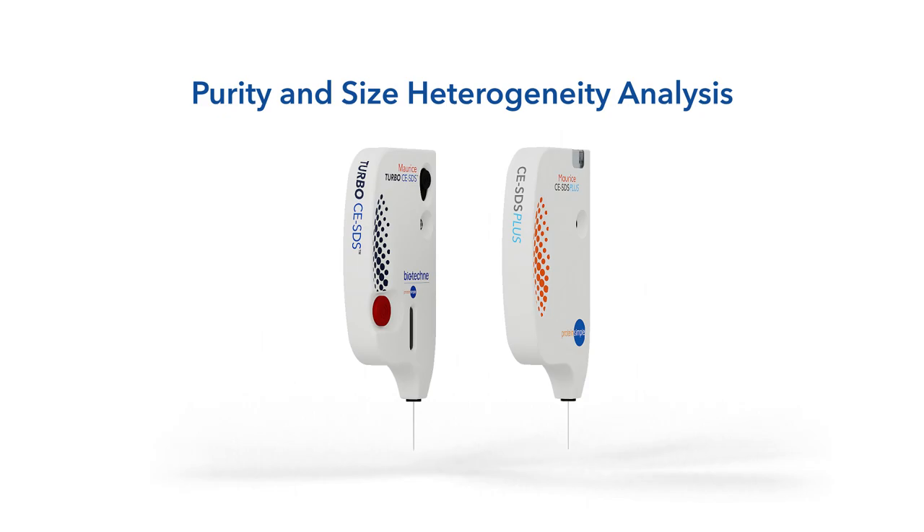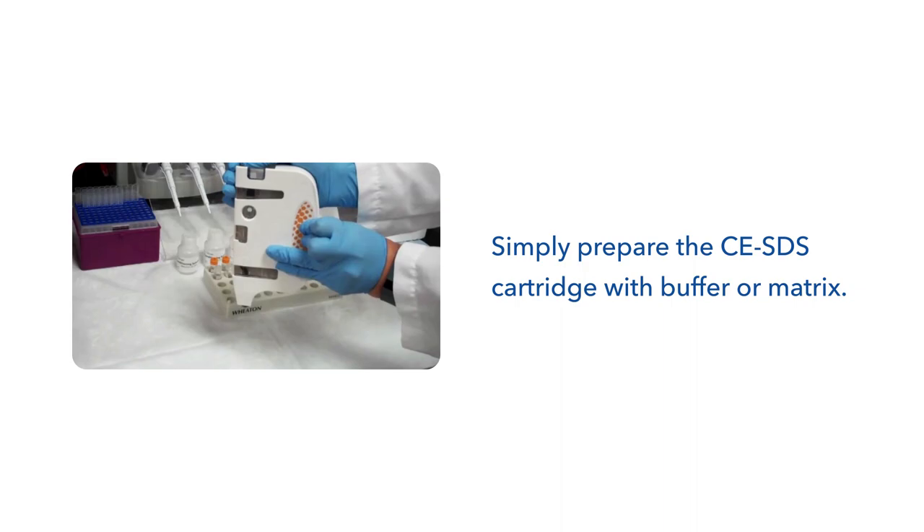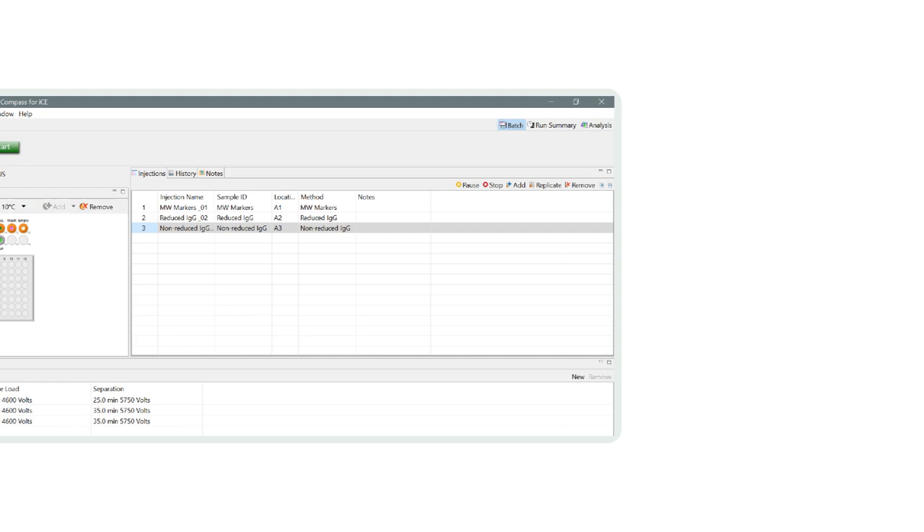How easy is Maurice to use? Let's start with purity and size heterogeneity analysis of your biologics with CESDS. Simply prepare the CESDS cartridge with buffer or matrix. Load the reagents and your samples. Close the door, set up a batch, and press start. Maurice will do the rest for you.